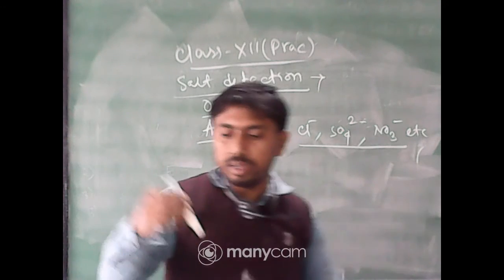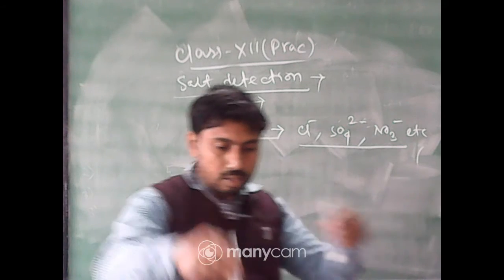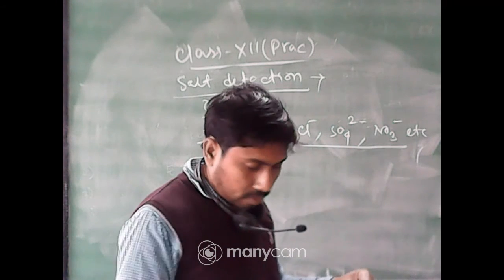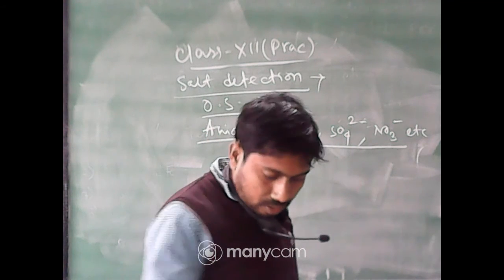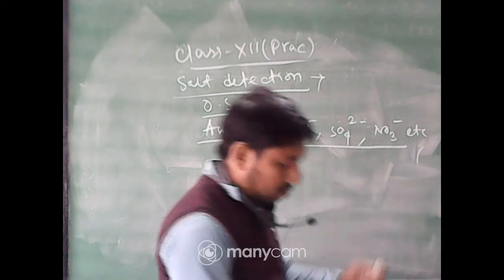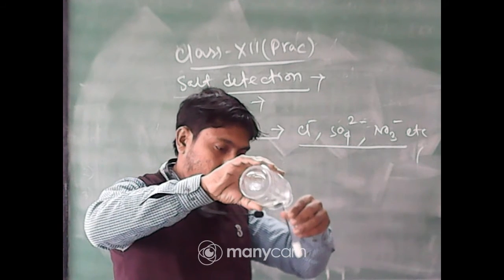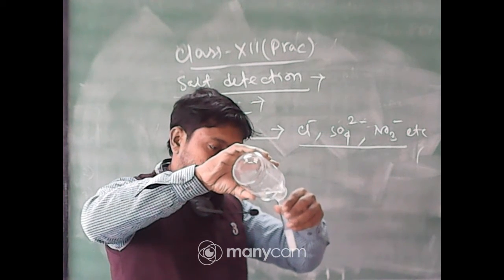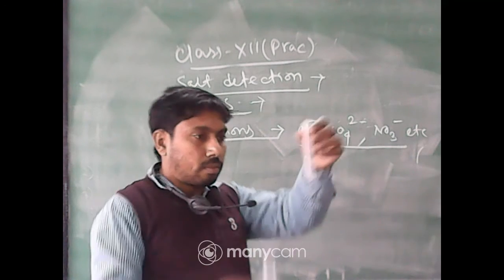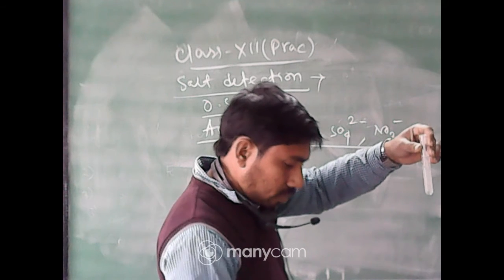I am taking a very little solution in the test tube and dissolving it using dilute HCl. Okay, a clear solution forms.